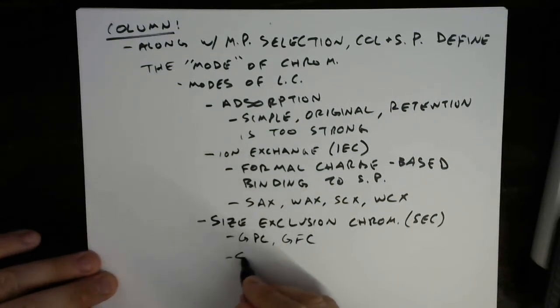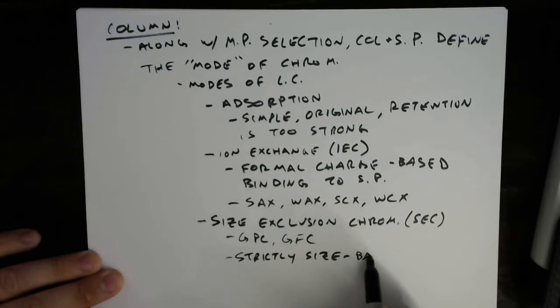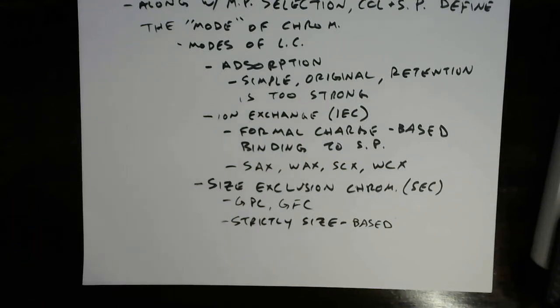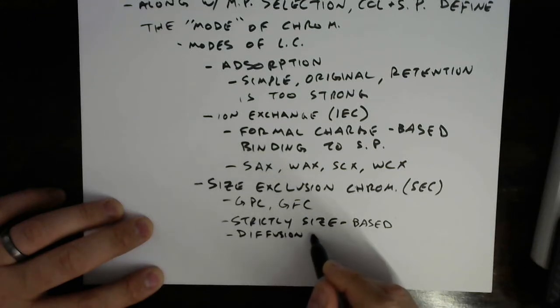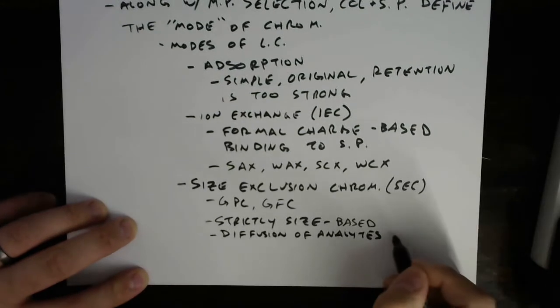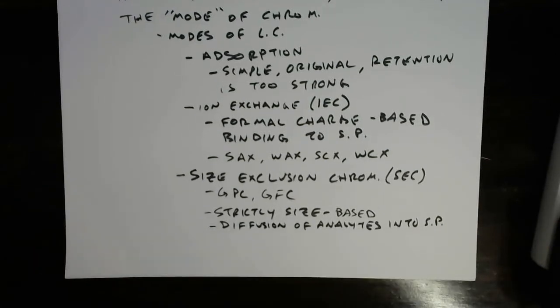This is strictly a size-based separation, and it is governed by the diffusion of your different analytes into the pores of the stationary phase.